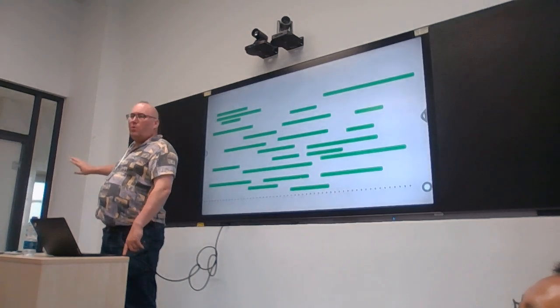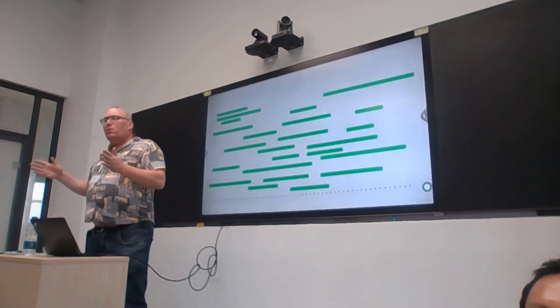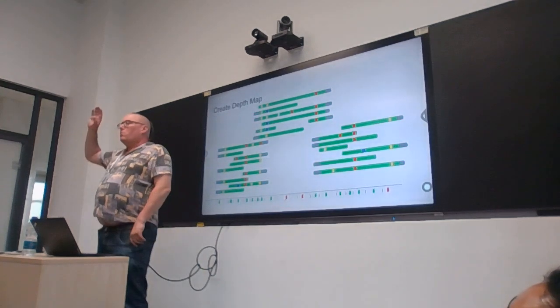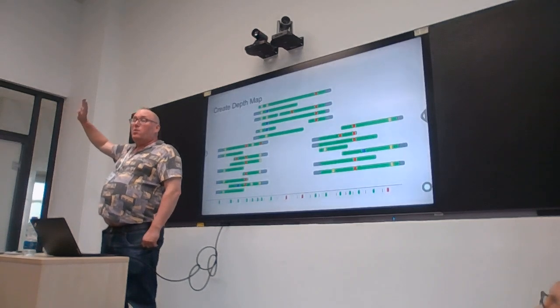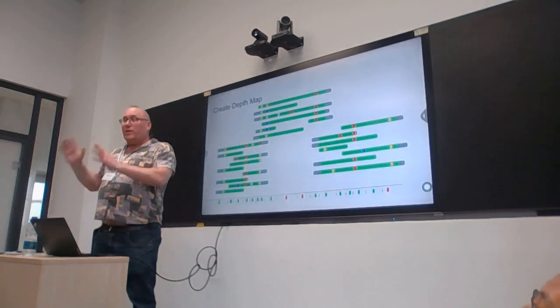We have to discard those regions when we're doing the analysis, especially with the Illumina, which is short reads. So that means that besides masking by depth, we have to mask out all of the regions which are repetitive, because there will be low confidence and we can't trust the results there.